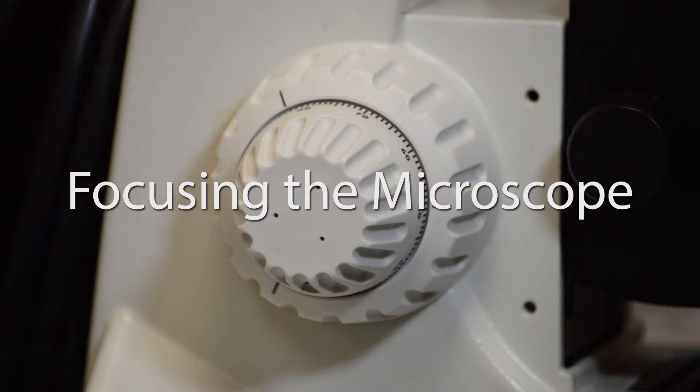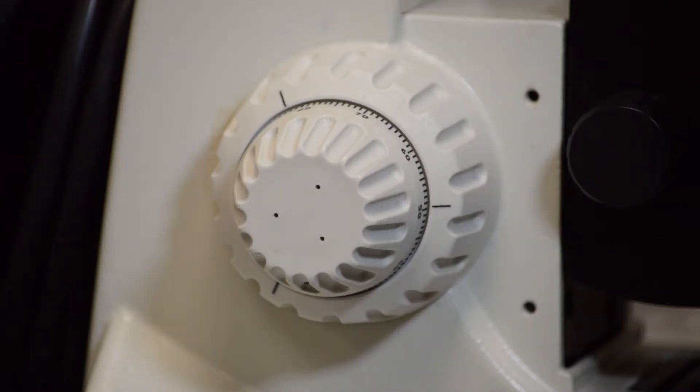The next set of controls we look at are on the side of the base of the microscope on the support, and these are the coarse and fine focusing adjustments. What these do is these move the stage closer and farther away from the objective.